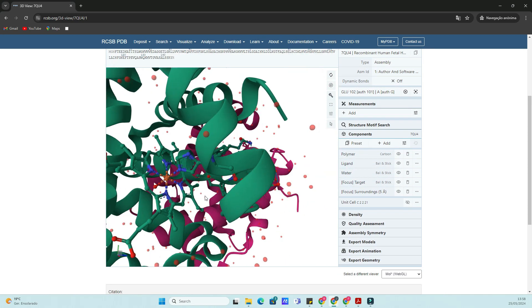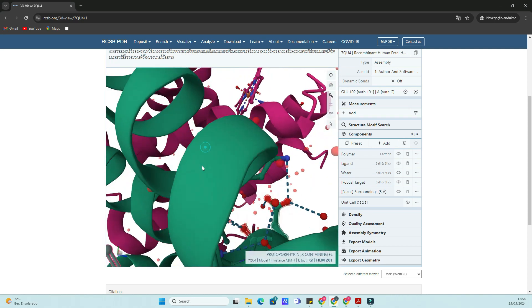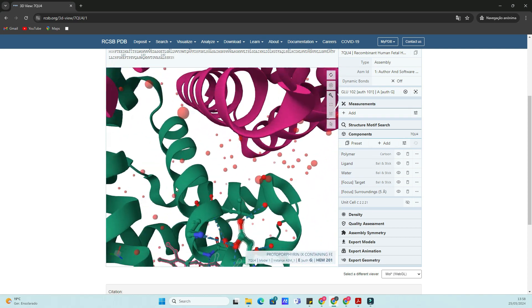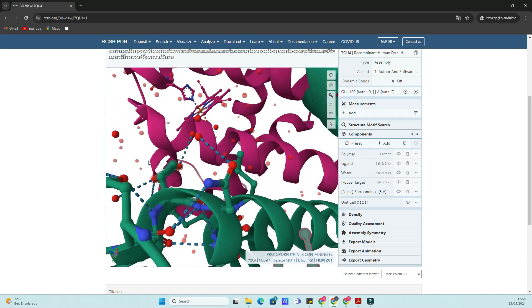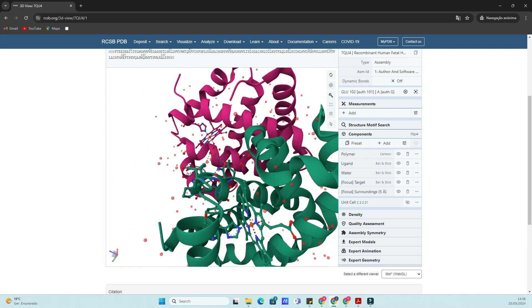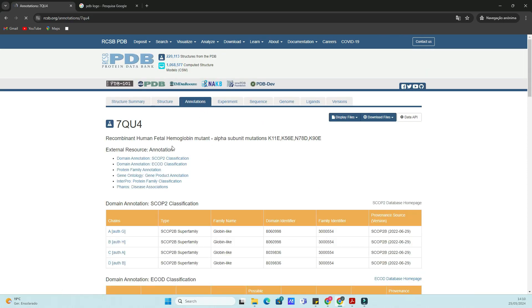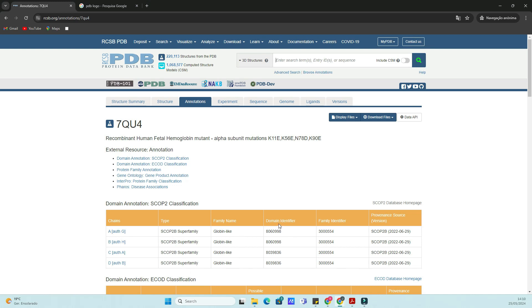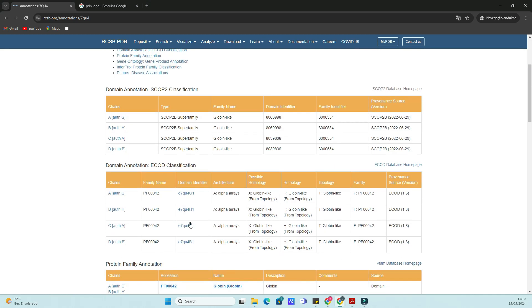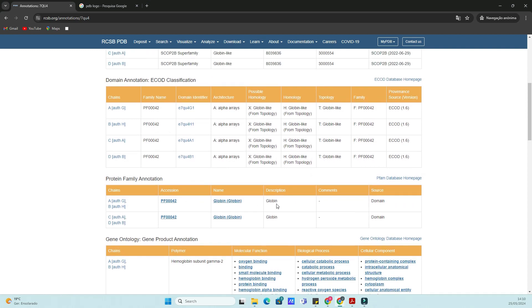You'll see an interactive 3D model of the hemoglobin molecule. You can rotate, zoom in, and zoom out to explore different parts of the molecule. On the right side, there are various options to change the display style, like Space Fill, Wireframe, and Cartoon.